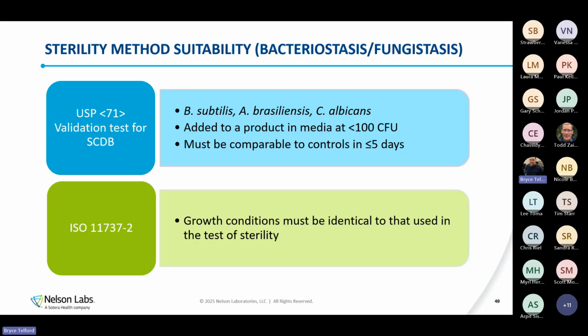So a bioburden test, a lot of times, like we were showing in the video, we're trying to get organisms off the product and into that solution, and then we're filtering that solution away in most cases. In a lot of cases, that means that we are potentially filtering away inhibitory substances. So that could potentially be a good thing. The flip side of that is sometimes those inhibitory substances actually become concentrated on that filter. Now it's more inhibitory than it was.